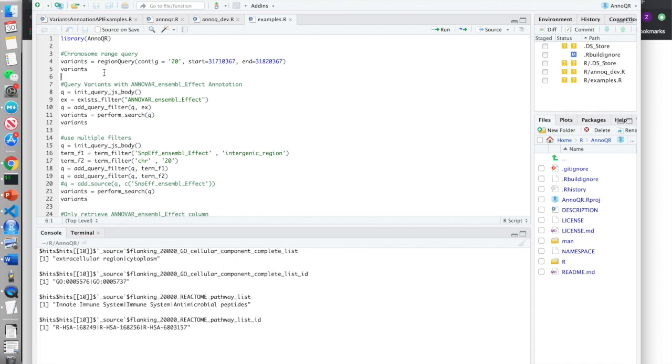And if you have more customized requirements, you can use this R client in another way. For example, all of those functions named with underscore are kind of like inner functions, and functions named in this camel style are complete functions.